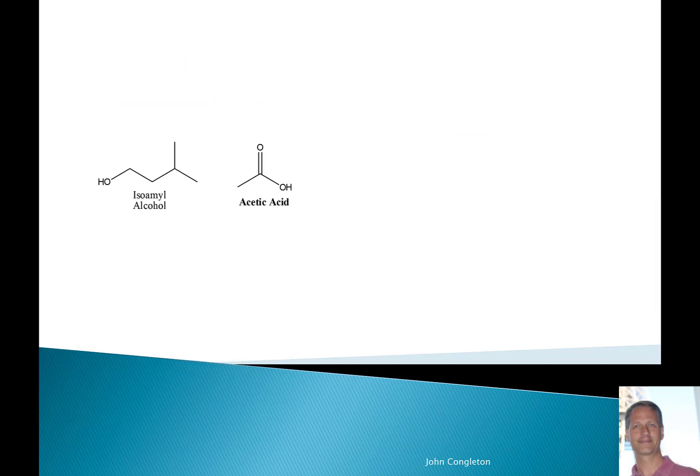Our reaction will take an alcohol and a carboxylic acid and we're going to use concentrated sulfuric acid. It's a Fisher esterification reaction. It's reversible. We're going to make an ester, isoamyl acetate, and water.